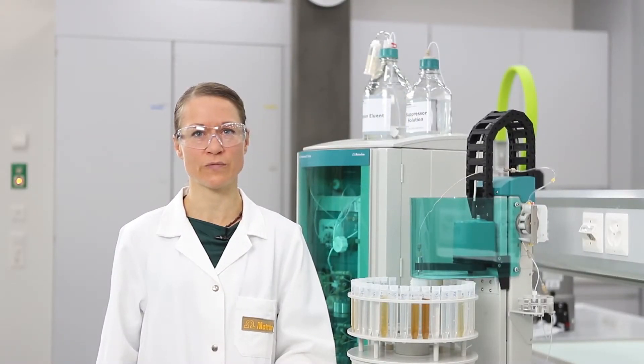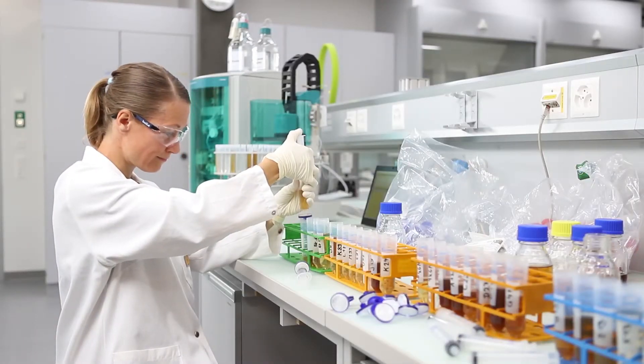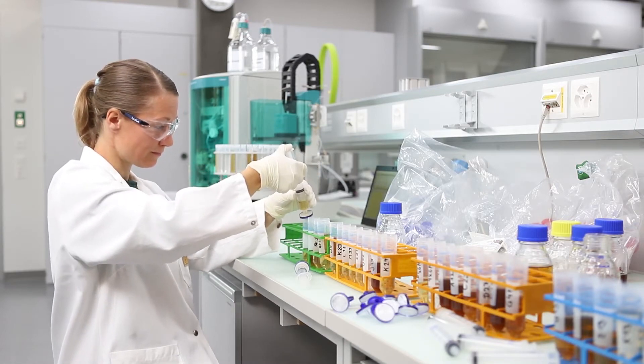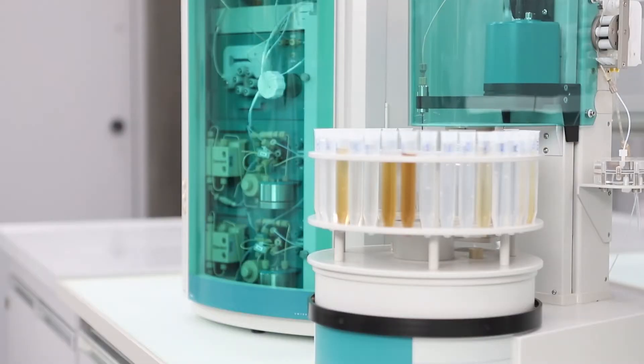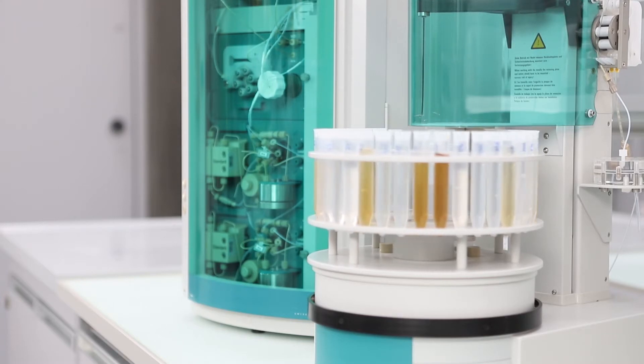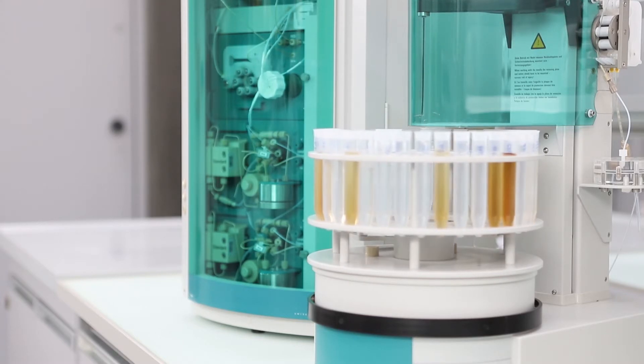Inline ultrafiltration has many advantages compared to manual filtration. Filtering a sample manually takes about three minutes. For 100 samples, that's already a half day of work. Inline ultrafiltration runs while the previous sample is being analyzed, so not only does it save manpower, it also increases sample throughput.